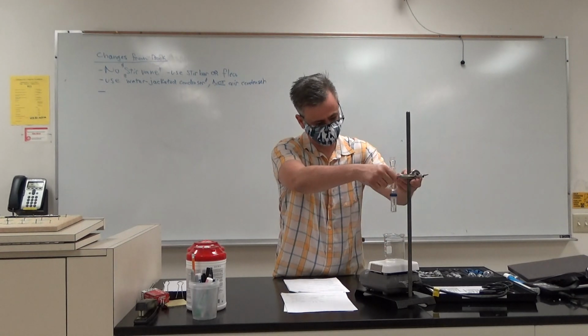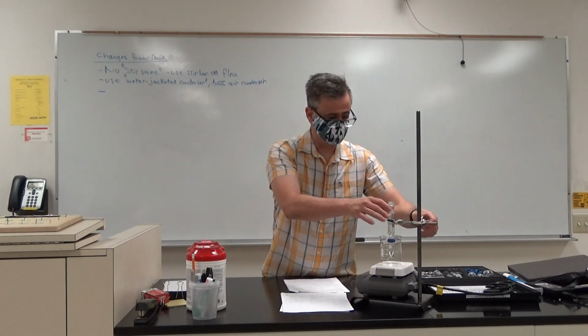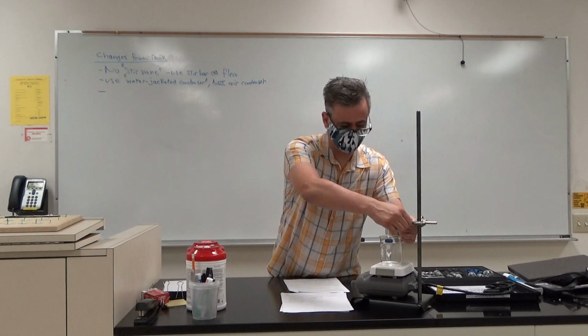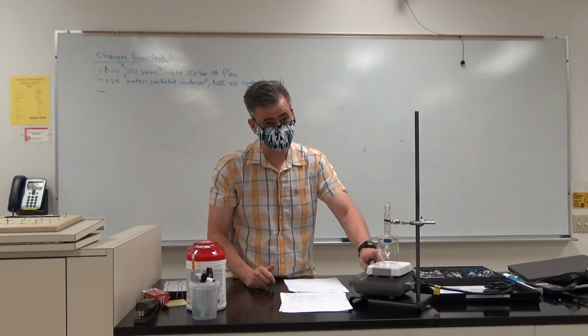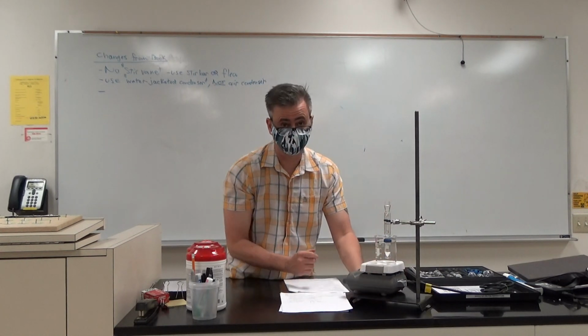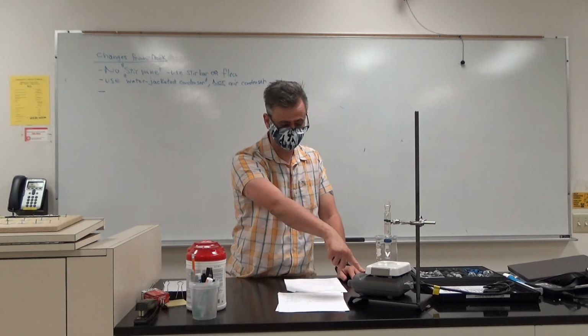Okay. And then that guy's going to sit down in there. Okay? You always want to make sure that this guy is centered in the center of the stir plate. You don't want it off in one corner, or it'll stir crazy. So you want whatever it is you're stirring in the center of the stir plate. All right?